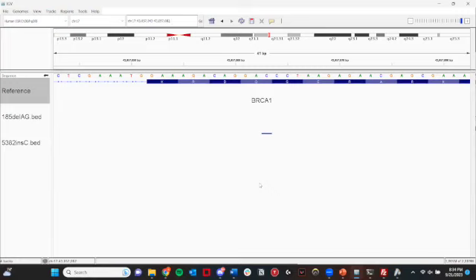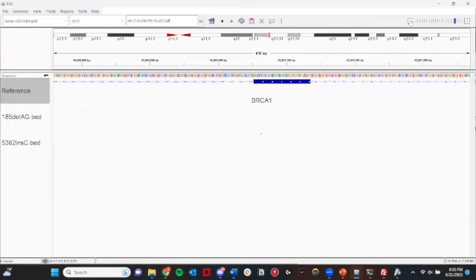Okay, everybody, please try to do this. For these two mutations, you don't have to do it right now. You can do it at home. Try to find the allele frequency of these two mutations. Allele frequency. Let me tell you this. For these two mutations, try to find the allele frequency.